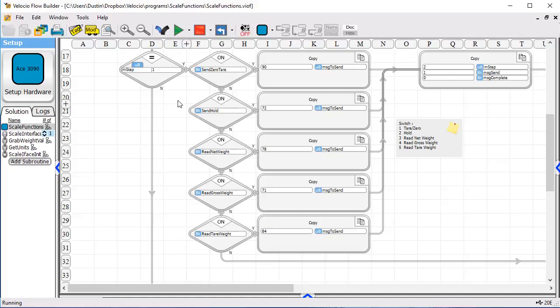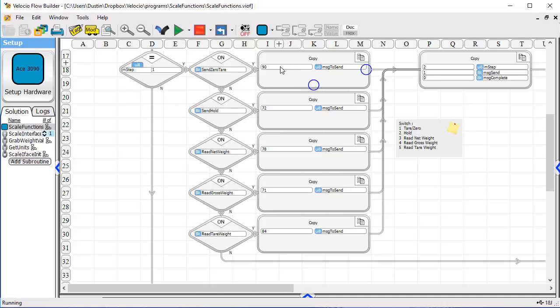The messages that are required by the scale in order to do these functions are very simple. So they involve one character and a line feed. So the characters, the ASCII equivalents for them are listed here in these copy functions.